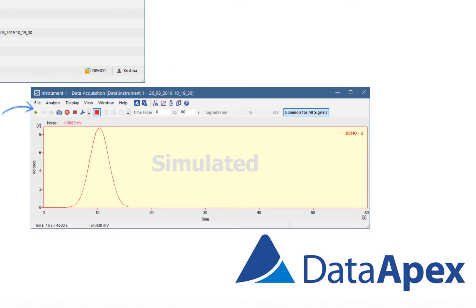Toolbar above the graph panel provides icons for controlling data acquisition, such as starting, stopping, aborting and taking a snapshot.